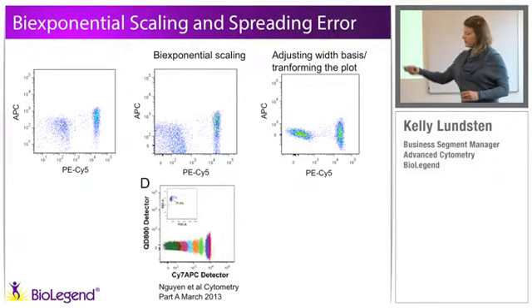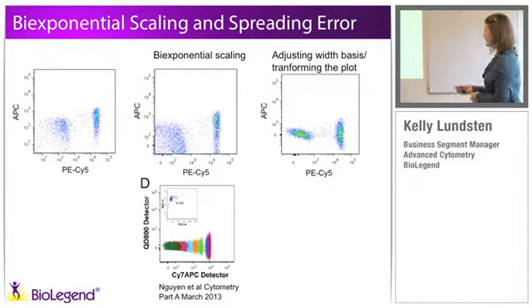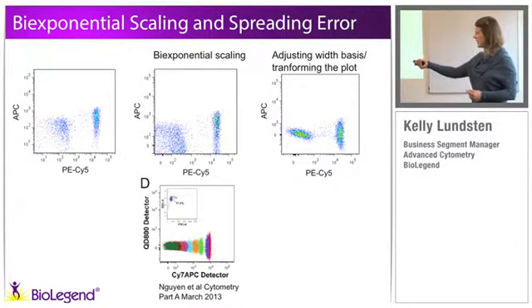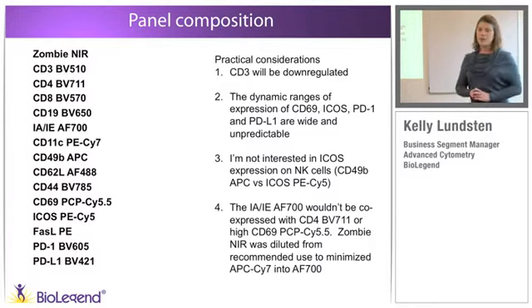So this was also visualized really nicely in that paper from Mario. It was in Cytometry Part A. I highly recommend that anyone who's interested in multicolor flow cytometry read this paper. It's very instructive. And here you can see what they're showing you here is that the brighter the signal gets, and again, these are just beads that have been coated with different amounts of the antibody, the more significant the spreading error gets. And that's because the brighter the event is, the greater the distribution of error around the detection of that photon. So that's actually a very, very short synopsis of an extremely complicated concept.